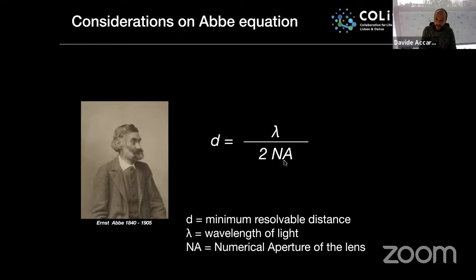So please be aware that what you see through your microscope is not your object, but an image of your object, which is the product of the object, all the aberrations that are already embedded in the sample preparation, staining, and so on, and then all the modifications that are given by your optical system. All right, so again, this is a further invitation to talk to your experts.